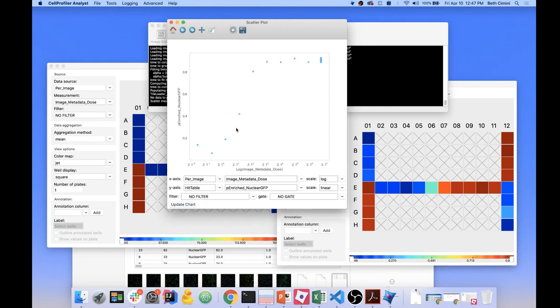And you see I have a pretty nice dose response curve here saying that this is about the dose that shows 50% translocation, and that I could go to this dose and still get almost as much translocation as my positive control that's 150-fold, but at 2 to the 2 dose as opposed to 2 to the 7 dose. So we can go down about 30-fold with our dosage and still get about the same nuclear translocation effect.